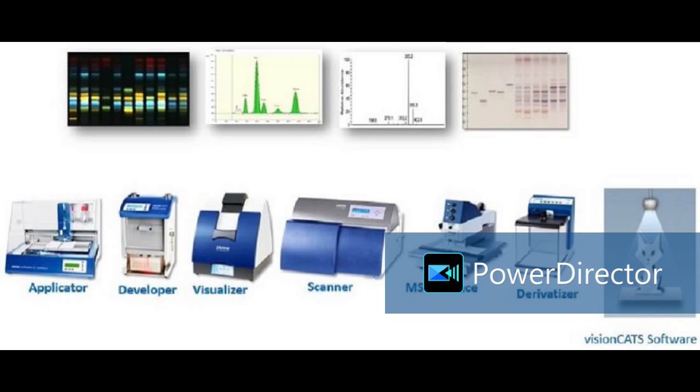Again, with spot-wise application, some molecules will remain on top of the line and some behind the line. So there is no equal opportunity in front of every molecule to travel on this track, no equal chance. Therefore we see merging or diffusion of separated components, the separated spots. We avoid all that here. We apply samples and standards in the form of bands.